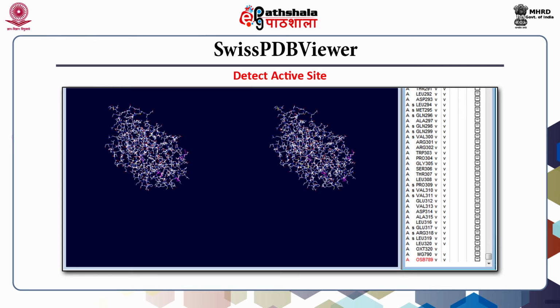Scroll down to the last residue in the control panel, that is, residue number OSB789. Select this residue OSB 789 by clicking its name, that is the label, in the first column of the control panel. The selection will be conveyed by changing the color of the label OSB 789 from black to red. This will display as shown in this slide.